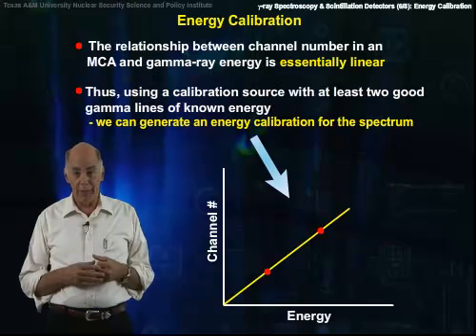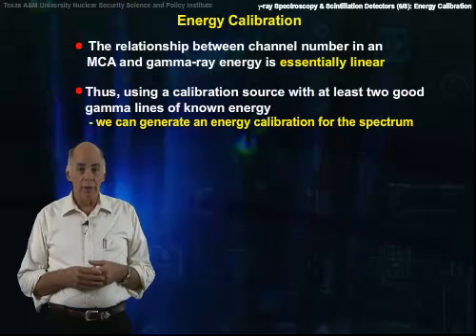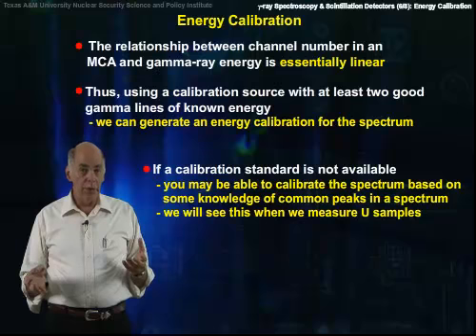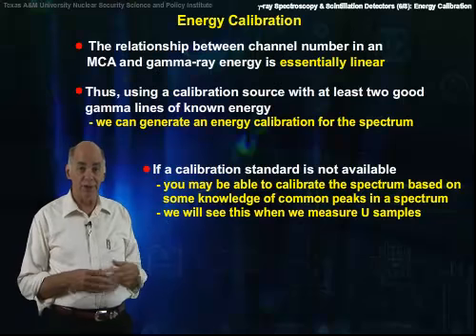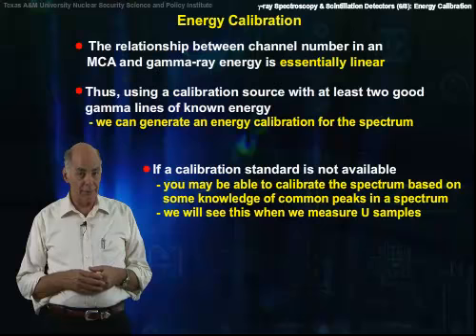calibration for the spectrum. Depending on what we're trying to measure, if a calibration standard is not available, you may be able to calibrate the spectrum based on some knowledge of common peaks in the source spectrum itself. We'll see this when we measure uranium samples.